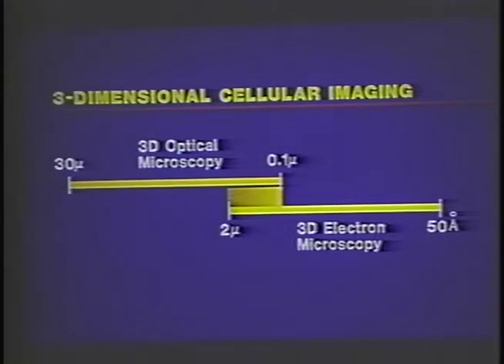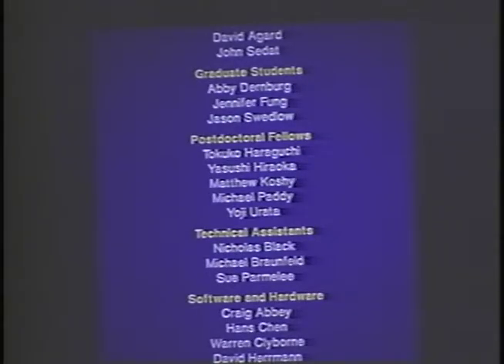Okay, and so as Lee mentioned, every reconstruction you do is of a unique object, and what you then want to do is compare important features of one object to the next. You don't have the benefit of the crystallographic averaging that goes on in the very high resolution diffraction type microscopy. Okay, now this is probably the most important slide.